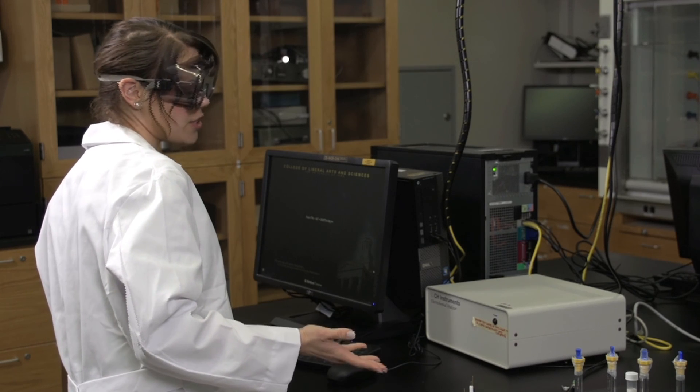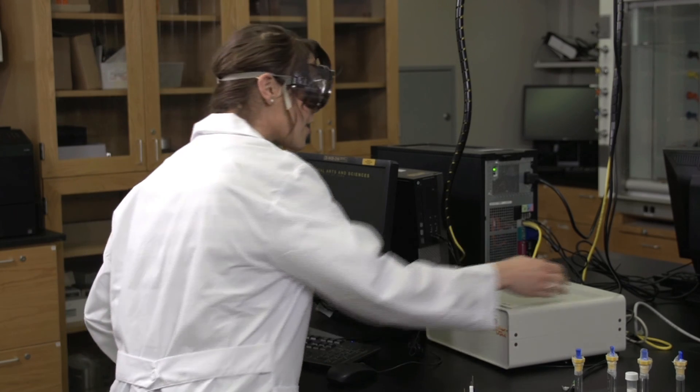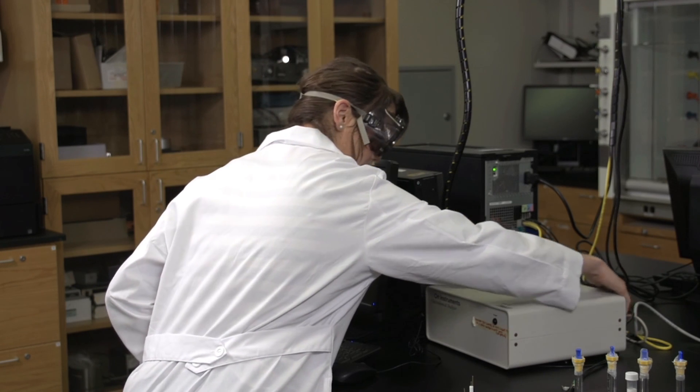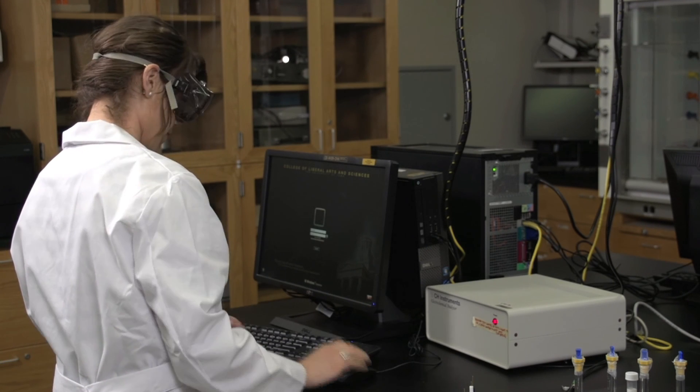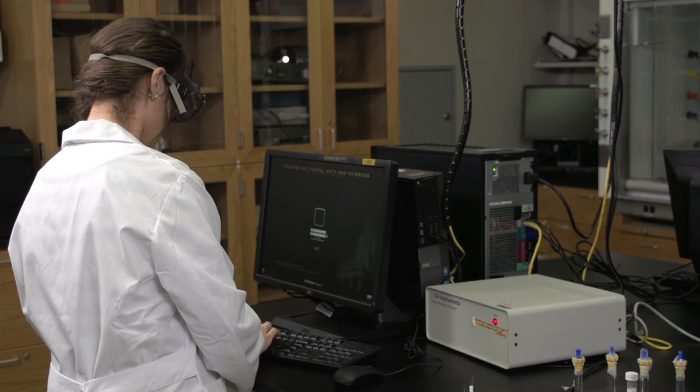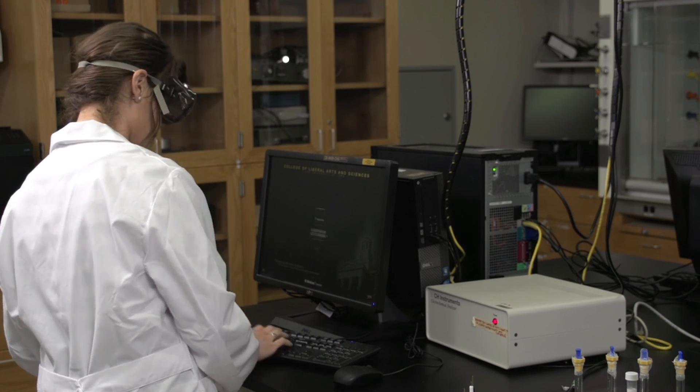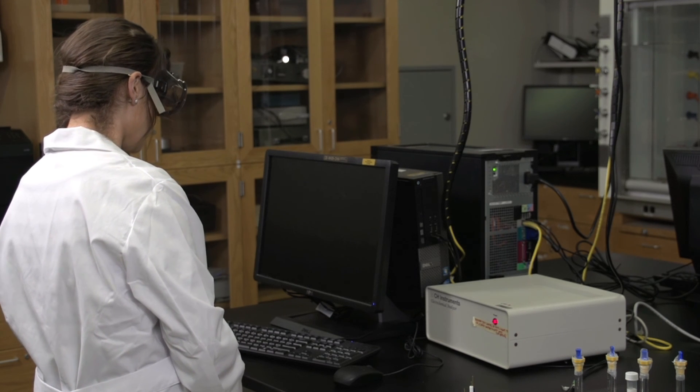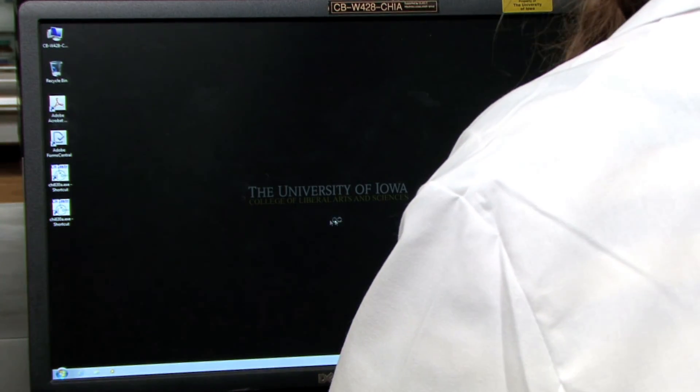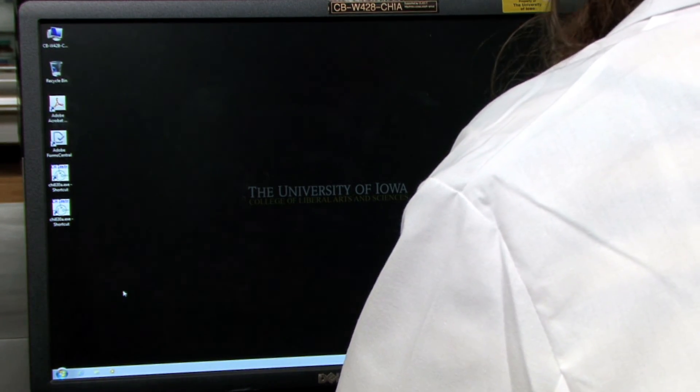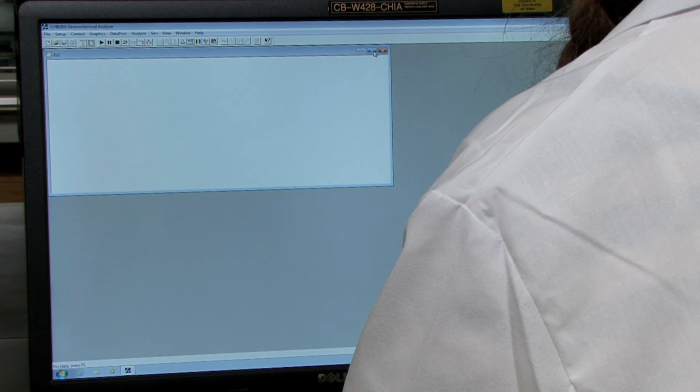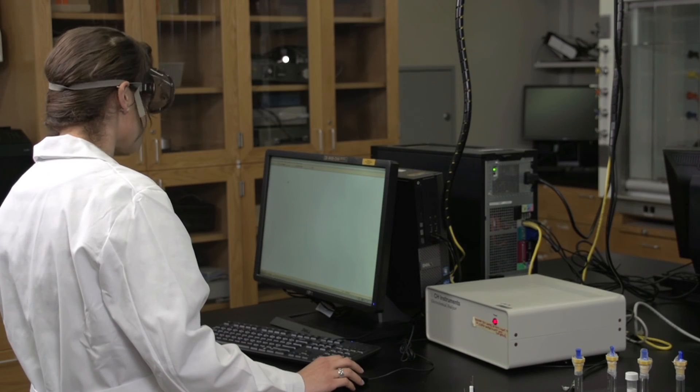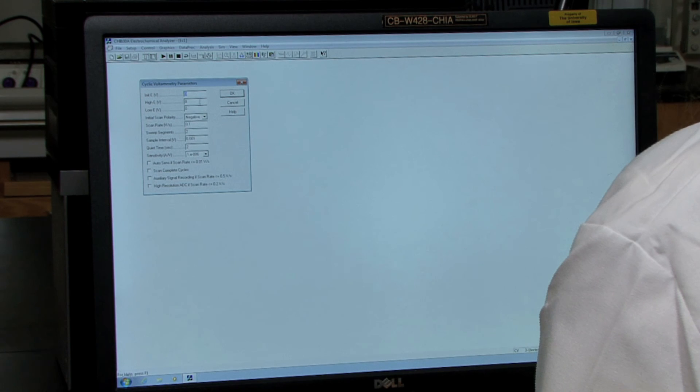When your solution is finished purging, you can turn on the instrument and log into the computer. To turn on the instrument, there's just a switch at the back and the power light will turn on. Once you're logged in, you want to hit the CHI 630 icon which will open up the software. Maximize both windows. To open the parameters window, click on the icon that says parameters, and this will open up the parameters for the experiment.